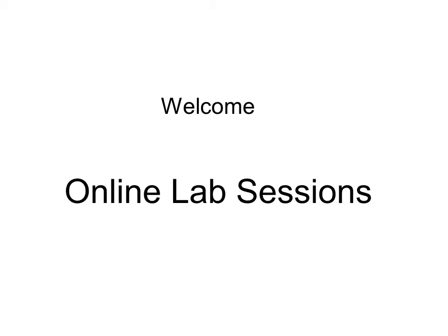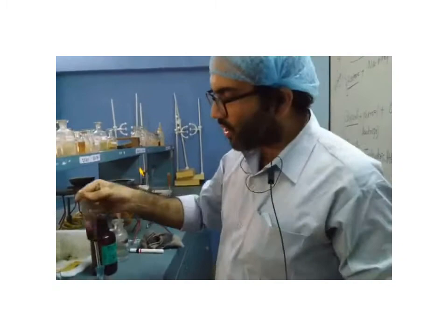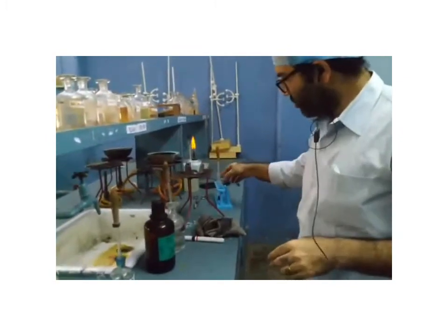All right, so let's get started with the experiment. Moving on to our next experiment, we are going to do it with glycerol.